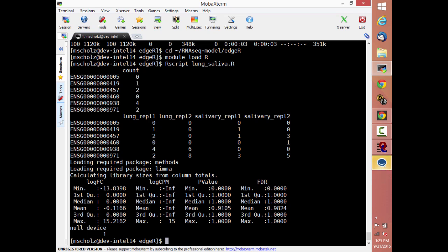There are a couple of things, and we'll look at the actual code in a minute. First, it prints out genes just so that you can see what it looks like. And then it prints out the table of all of the genes, or the first 5. You'll see here it's the same 6, excuse me. But now it's looking at them between all 4 conditions. So it took all of your data.